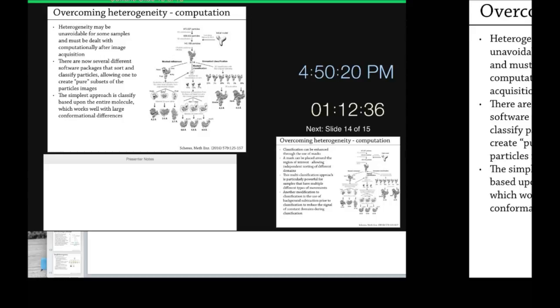So you need to go back and manually pick particles again? After you've done auto-picking, you can manually alter that set. So with RELION, you can display it. With other software, you can display it. And then if you can clearly see that it's mispicking or it's picking off, then you delete it and repick where you think it belongs. Another way with RELION is you can extract recentered and then use those to redisplay, and sometimes that'll do it. If your initial particle picking is way off, then sometimes it's kind of stochastic how well it'll be able to center it. And so you can recenter a couple times and that can get out of that hole. Does that make sense?